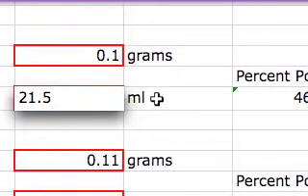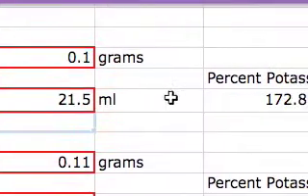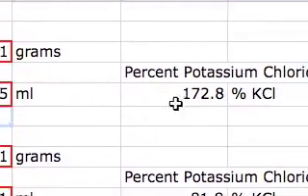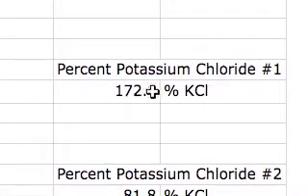Hit Enter, and then to the right you'll see a percent composition for potassium chloride.